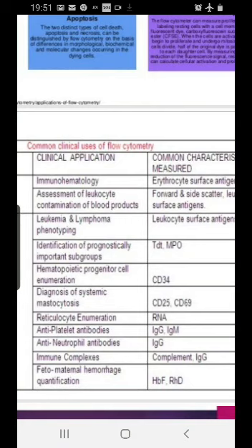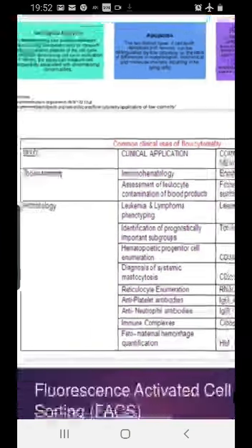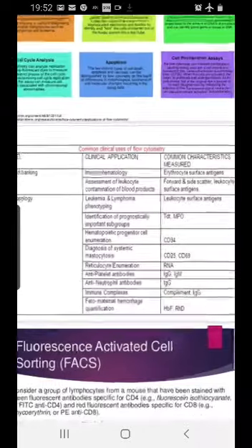So what happens is we just don't let that happen. We run the whole bag or a small sample through flow cytometry to understand the number of leukocytes, and if it is more, we centrifuge again and try to take out all the buffy coat from it, and then we make sure that we give 95% pure PRBCs to the patient. So this is a big indication in blood banking as well, especially in transplant patients.